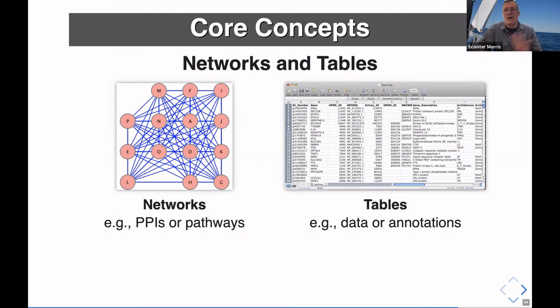And it's just an internal representation of a graph, okay? Then there are all these tables, and tables provide a lot of different information that we will link back to an individual node or an individual edge.